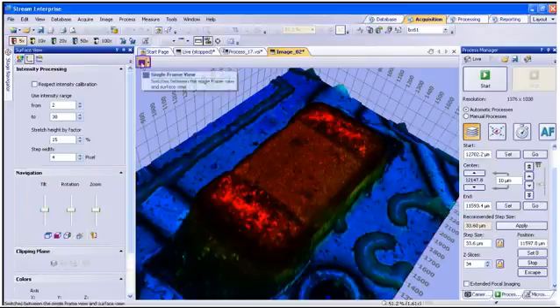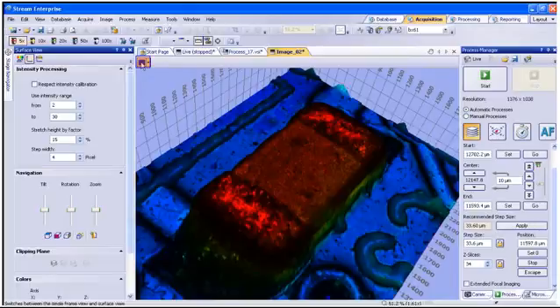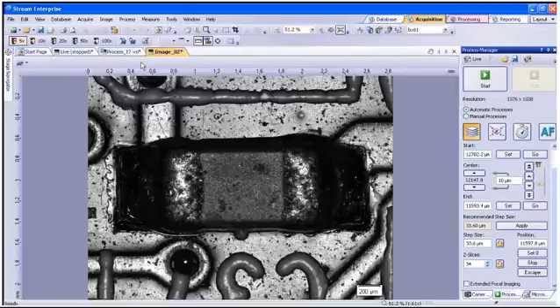Now go back to Single Frame View by clicking on the button at the top title bar of the image. We will now take some height measurements in Z of the image. This has to be done in Single Frame View, not 3D. It also makes it more accurate for point placement on the surface.